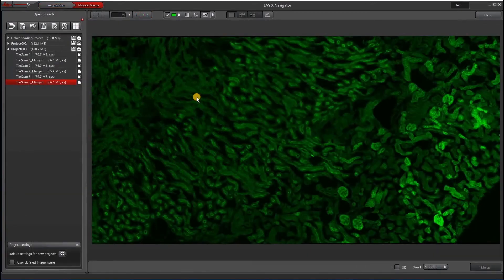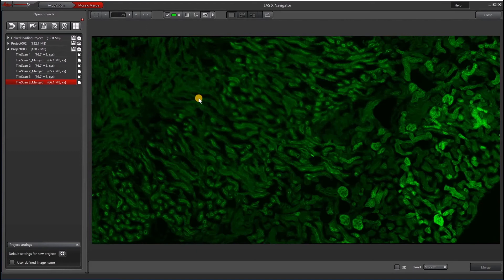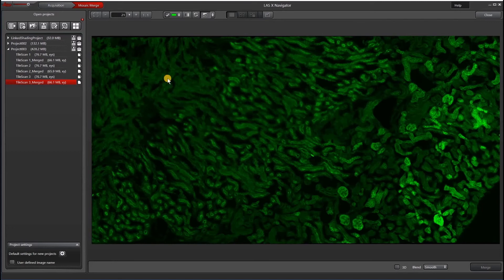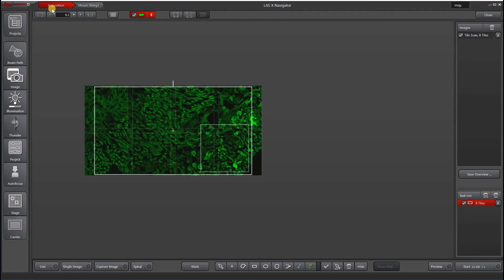Here's an example of an image that I took without AFC. You can see that there are some areas here that are very much in focus while others are out of focus. And while I can also apply a focus map to this piece of tissue, I can also apply adaptive focus control for hardware autofocus.